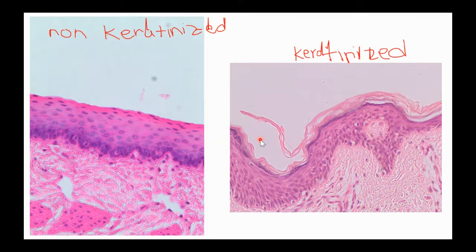So here on the outside, look at those cells. If they're falling off, we'd say it's keratinized. If they're still all attached, we've got a flat line of cells. You can still see their nuclei out here. That's non-keratinized, stratified squamous. If you remember from the application activity at the end of last week, we talked about how stratified epithelium is really good in places that are rubbing.